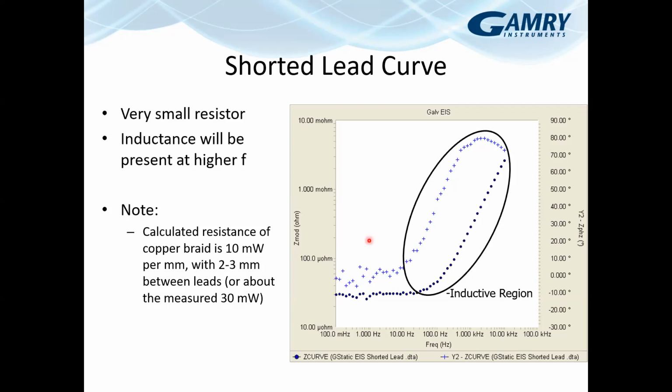Most even relatively modest size, standard size lithium-ion batteries, you don't usually see much below a milliohm. So this is much lower than you'd likely see for most systems. Another note here, this 30 microohms down here corresponds roughly to the impedance of a copper braid. So this isn't system limited still. There's a better test that we do internally to actually get at that system limit.